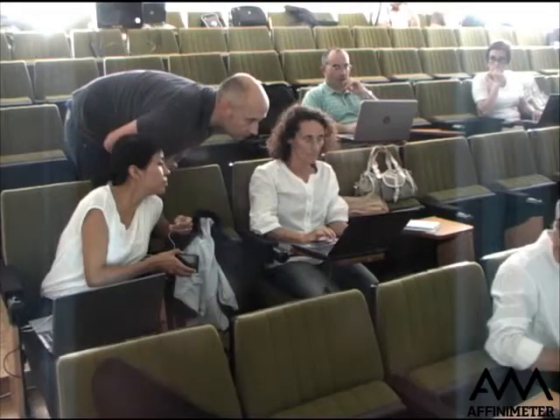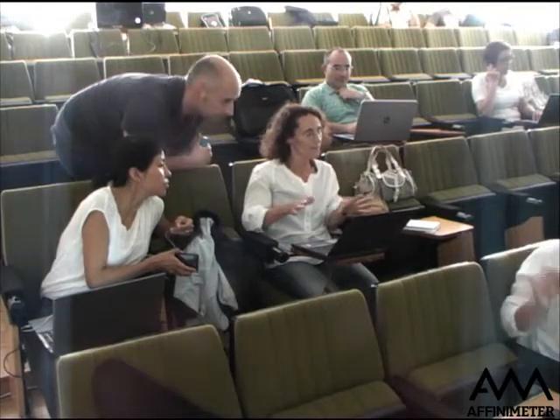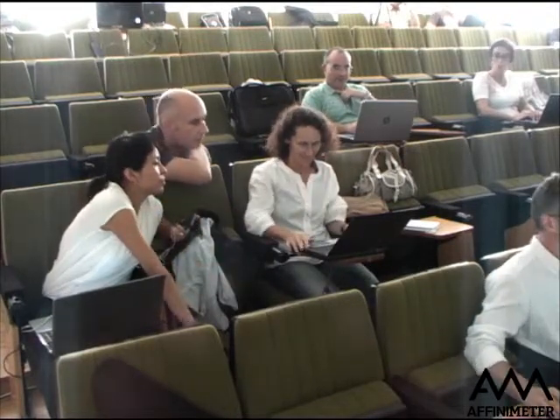Then it's asking for the model name, and before I give it the name, it doesn't allow me to follow your presentation. No, once you click on the Add Model button, I did nothing else. Just this window should appear. Okay. If you need me to go slower, just let me know, okay?